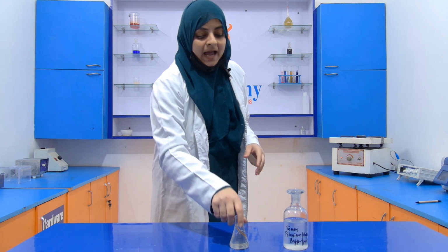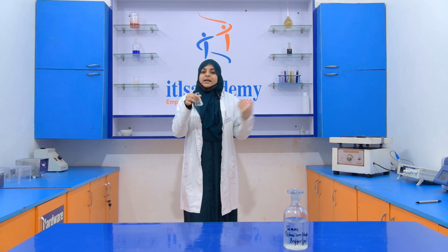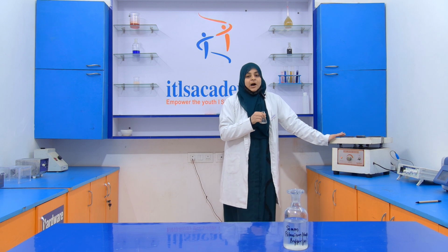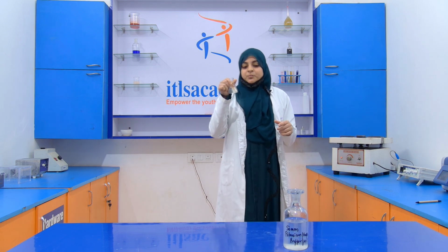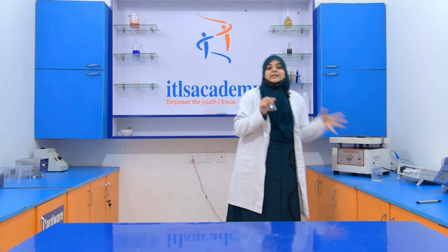So after the overnight incubation at 4 degrees Celsius, we are going to put this beaker into a rotary shaker. Now what we do, we change this potassium phosphate buffer every 30 minutes, and we do this for a 3 hours interval.